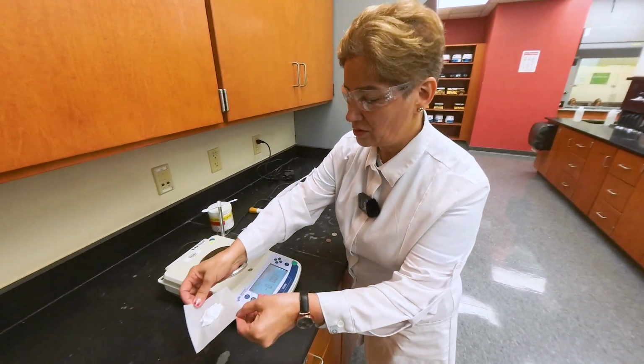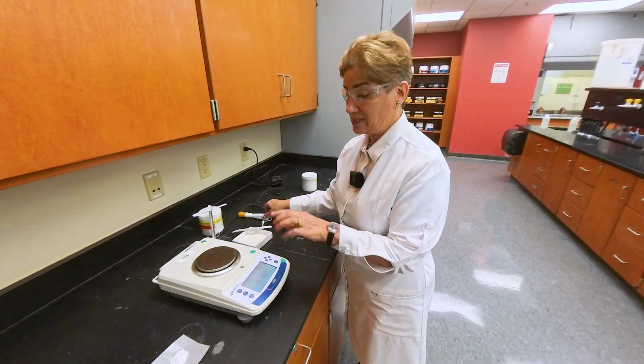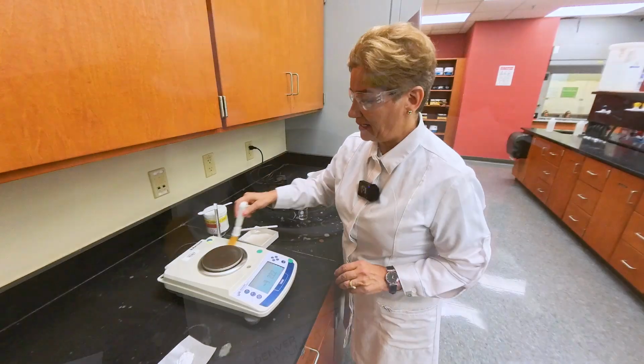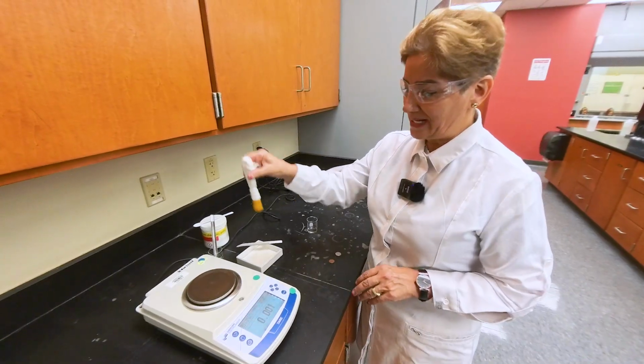Here's what we are going to do. All the chemicals that are used need to be disposed in the solid waste container. And we want to make sure the scale is maintained properly. So when you are done with measuring mass, there are brushes next to the scale.